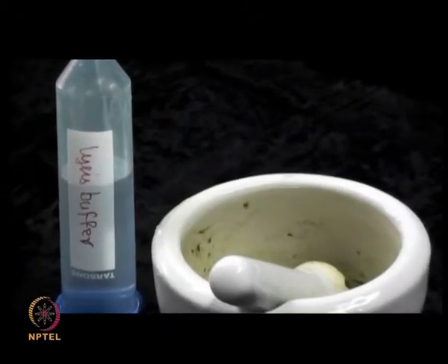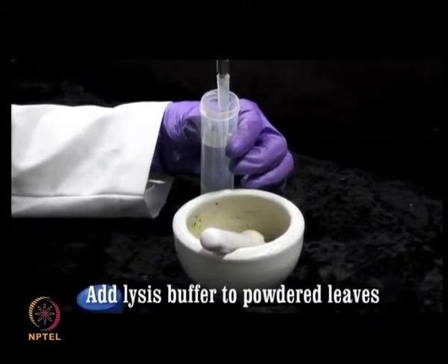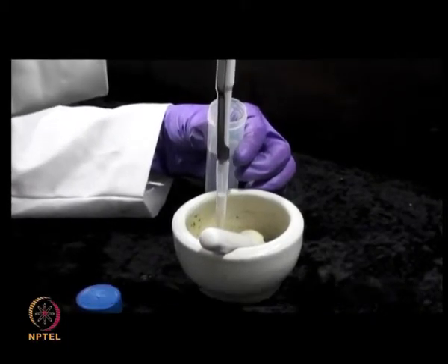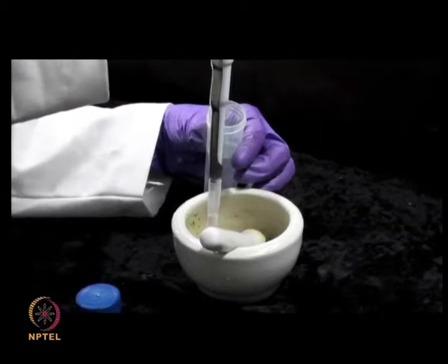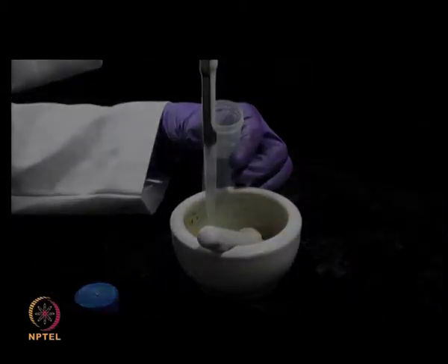To this powder, add around 0.5 ml of lysis buffer containing trichloroacetic acid, acetone and dithiothreitol, and grind it well until a fine paste is obtained.